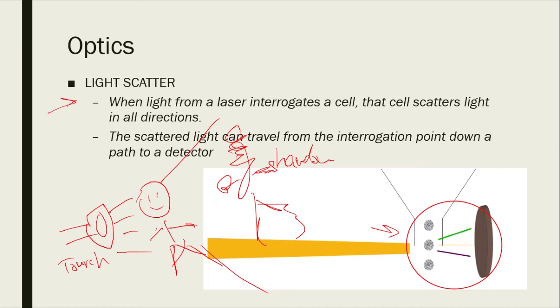Old man versus a young man versus a kid, right? So all this information, in a sense, is being recorded in the flow cytometry. Different cells have different shapes and carry different signals, and you can tell by shining a light through them. So you really cannot escape from this light. That is the idea.